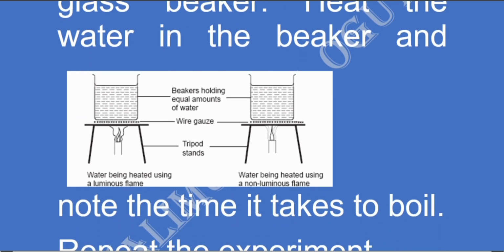You have the tripod stand, then the wire gauze, then the glass beaker. So this is for luminous, then this is for non-luminous. Note the time it takes to boil the water. Here you want to see which one is hotter than the other.